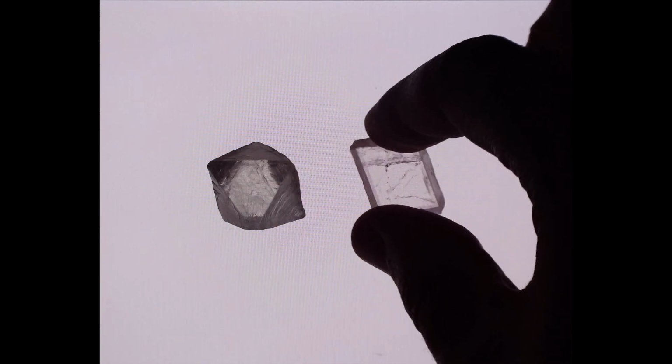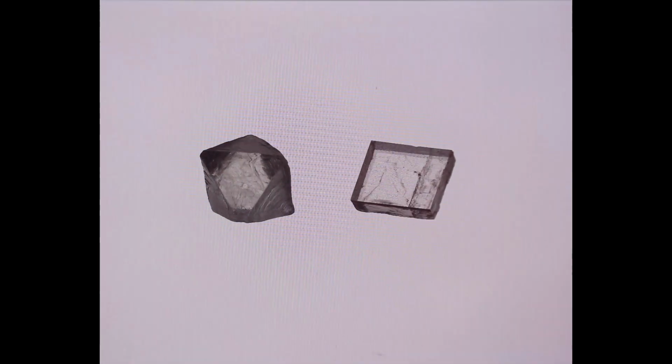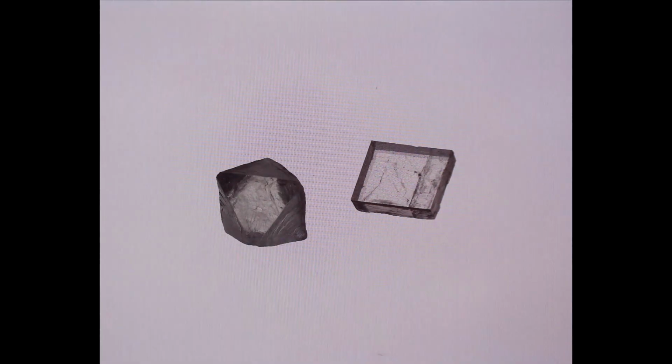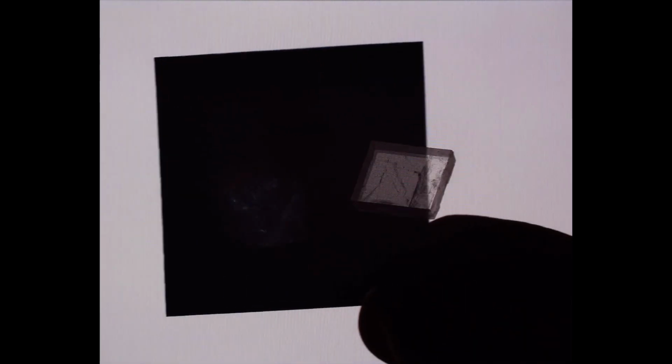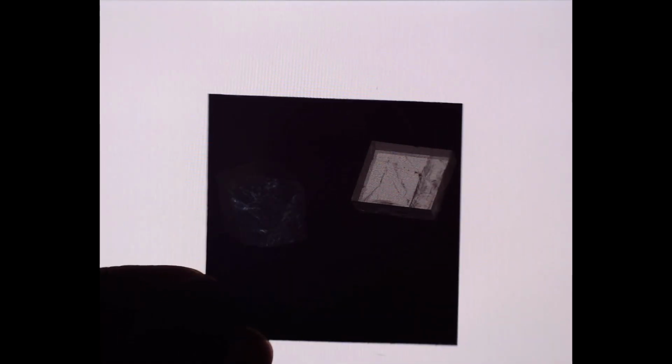So now it's important to remember, just because we don't see pleochroism doesn't mean that these aren't actually anisotropic substances. Our definitive test to distinguish these will be looking at them with crossed polarizers. And as I bring the upper polarizer in, you can see a distinct difference between our calcite and the fluorite. We of course need to rotate our minerals to be sure of what's going on here, and as I rotate the calcite, it goes from transmission of light to extinction, and back to transmission of light. So for our nice calcite crystal, we've pretty much confirmed that it is anisotropic.